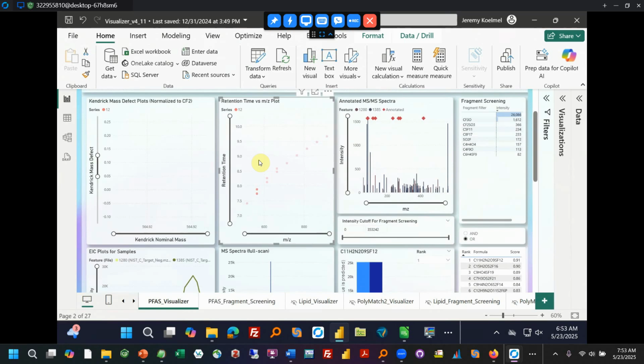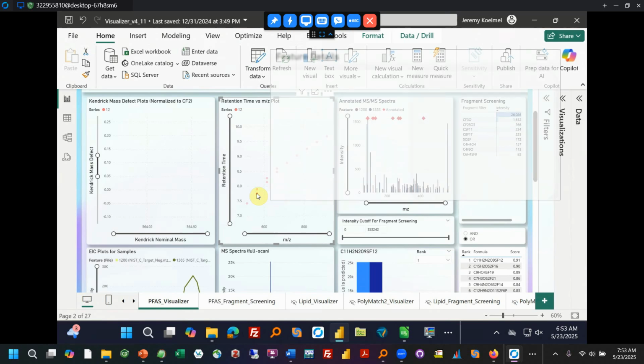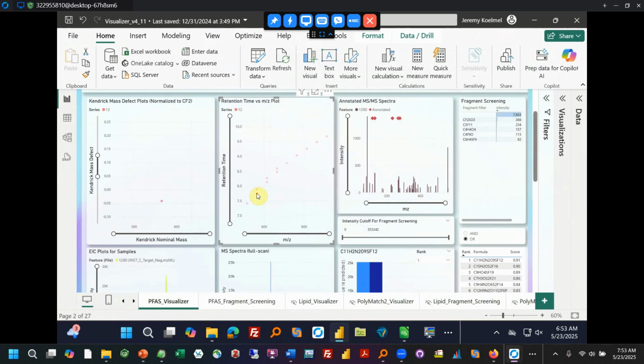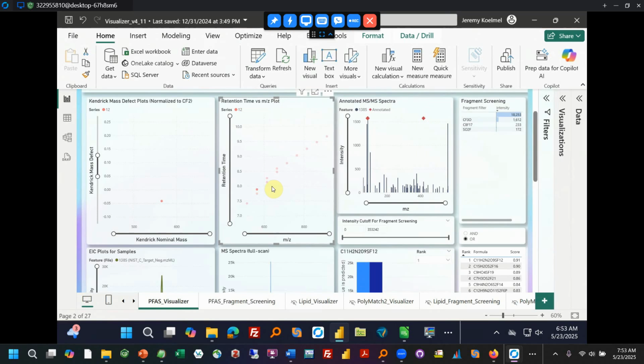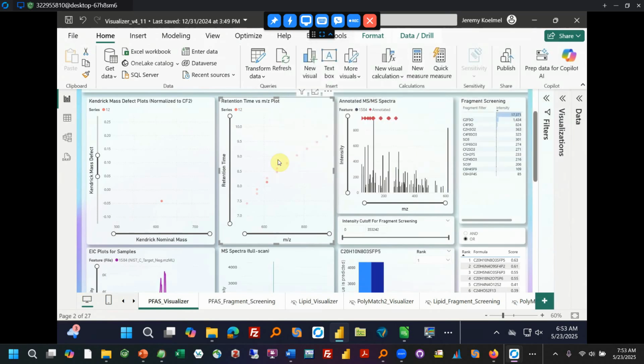But with the ethers, we can tell the position, right? So CF3O is the predominant fragment for one, whereas C4F9O is the predominant for the other. So you can see that there's 2 isomers here. Same thing over here, we can click through. C2F5O is the predominant, and in this case, it's also C2F5O.